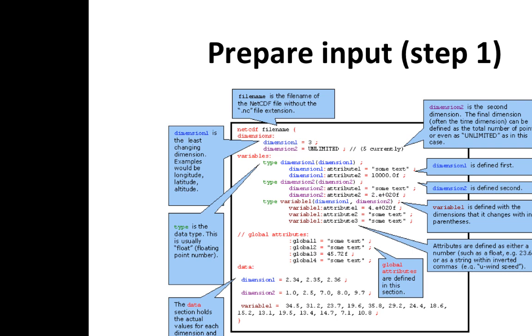This is if you really want to look inside a CDF file. It's designed for high density information. So this is the format, but we shouldn't bother with this. It's just for people interested in parsing it. We have really nice parsers, so this is just for your information if you really want to know.